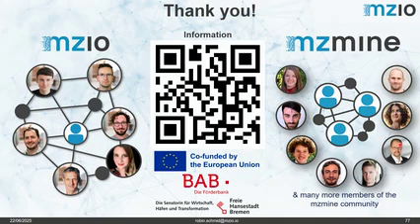And just a follow-up question, how do you define concentrations? Yeah, I think the project before started with the NIH library, and they used 5 micromolar standard solutions, and then we started with this setup. And then in the end we thought, okay, maybe if we can get more, then the intensity is high enough to do nice multi-stage fragmentation, because you always lose sensitivity along the way. So in the end we decided to go between 5 and 20 micromolar if possible.